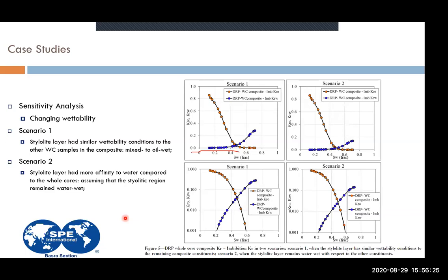Let's say you have a sample, and you try to perform two different scenarios, but in one of them you're changing your own sample, the pore system itself. So you're not dealing with the same structures. But here, when you do the acquisition and you have the 3D reconstructed sample, you have the same pore system, the same boundaries, the same conditions. So you can perform this kind of evaluation just by changing some of the parameters during your computations.